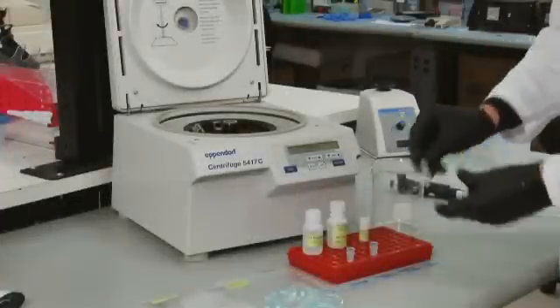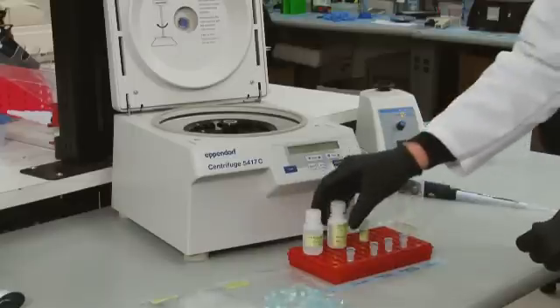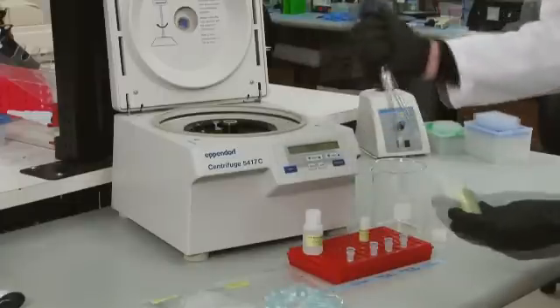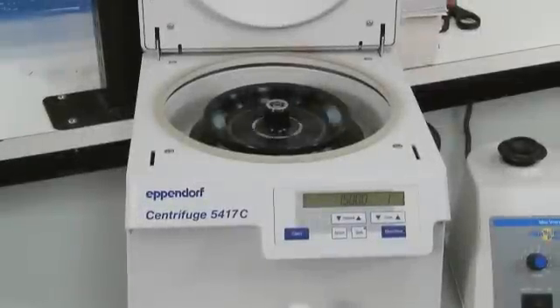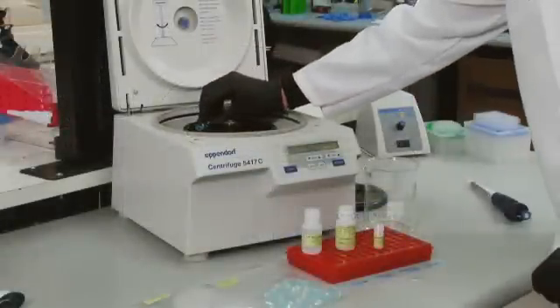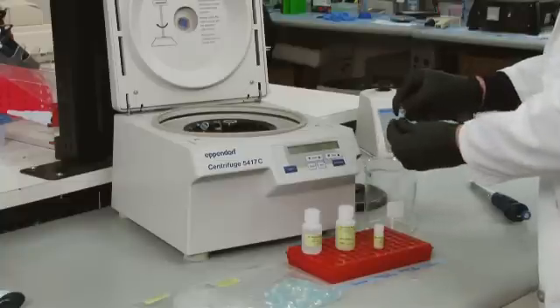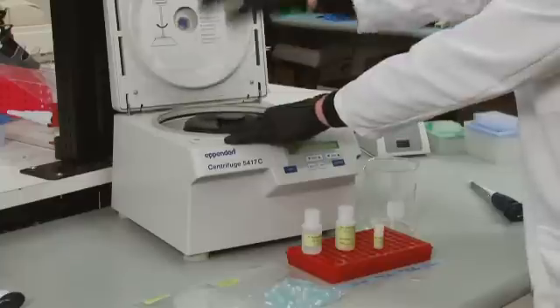Discard the flow-through from the collection tube and add DNA wash buffer to each column. Centrifuge the columns at 15,000 G for one minute. Discard the flow-through from the collection tube and spin the empty columns at 15,000 G for two minutes to ensure that they are completely dry.